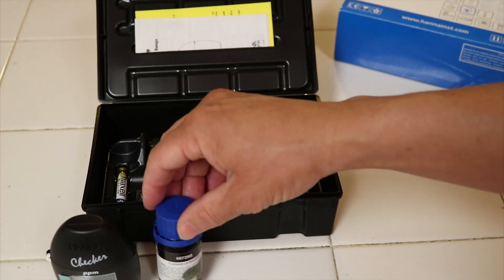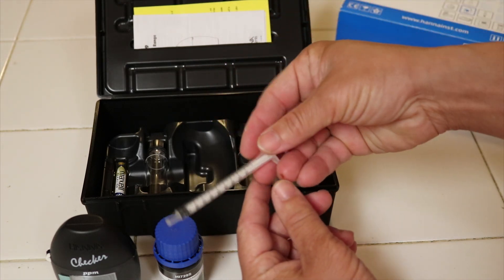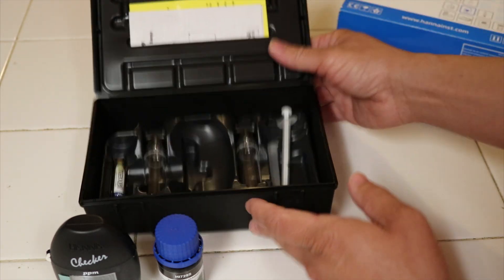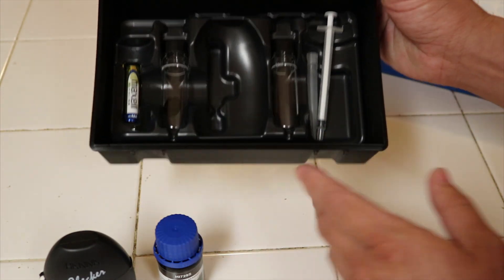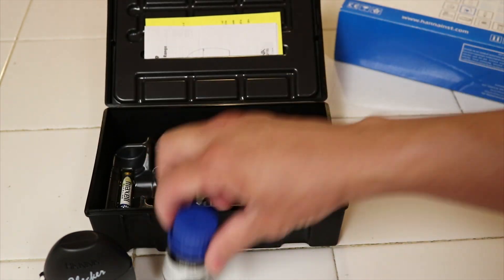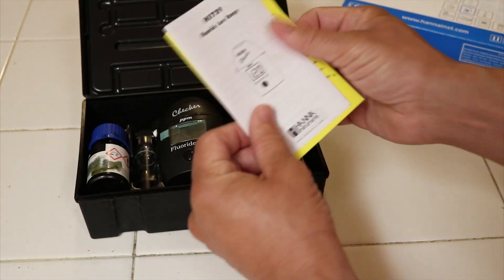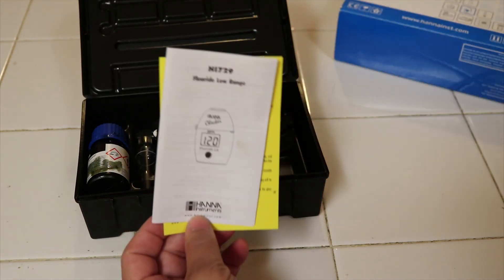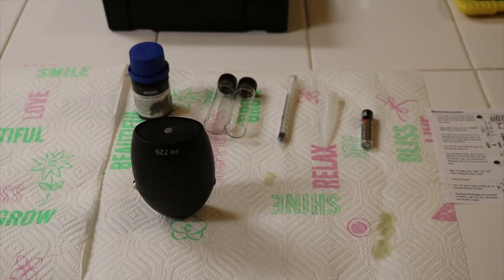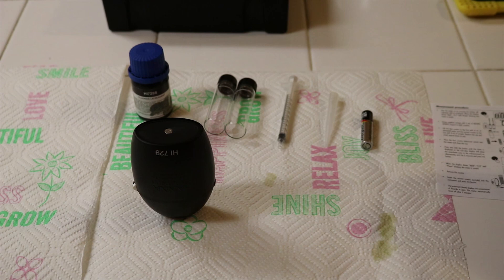There's some fluid on the side — hopefully that didn't leak out. We have a syringe type of thing here, a couple bottles, and a battery. First things first, we have to do what nobody likes doing, and that's read the manual. Let me read this and I'll be right back. All right, I got everything out now and let's get started.